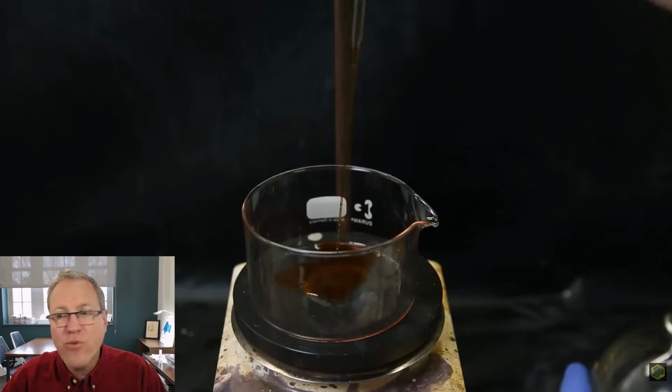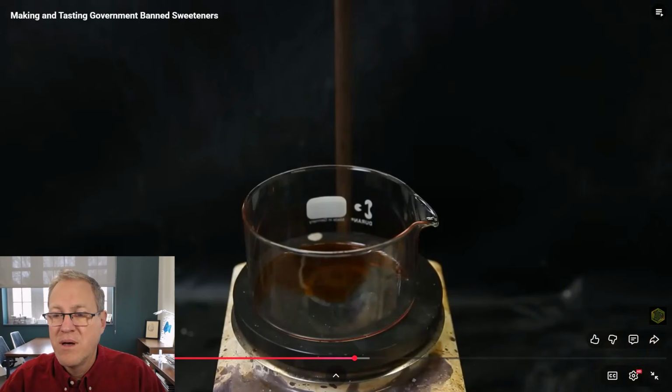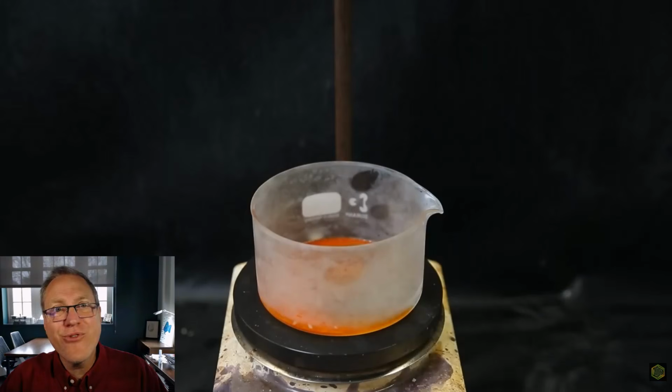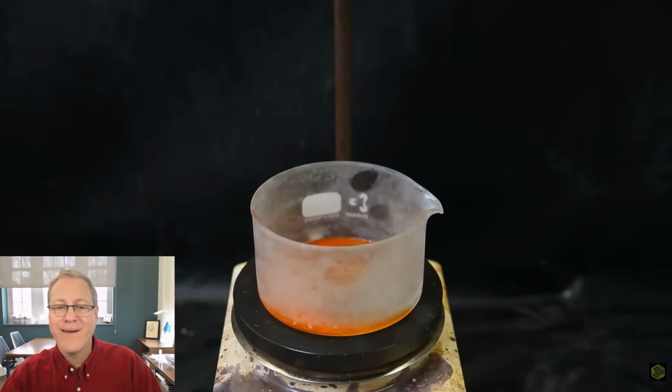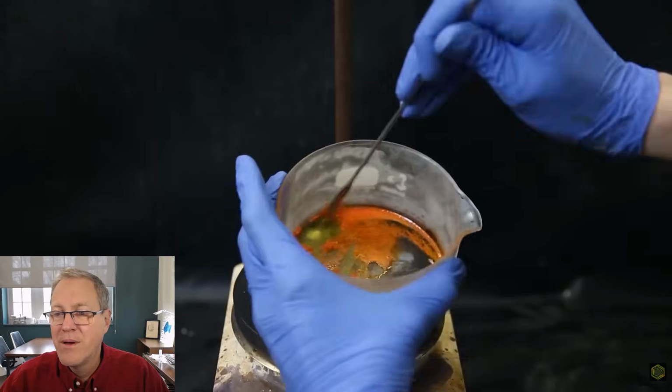So this is kind of a neat trick. He sort of spreads it out on this dish. And then set it in the freezer. It then crystallizes to a vibrant orange. Bam! And he gets his solid. Where'd my lights go? Come back. That's kind of cool. Orange solid that scrapes off easily.